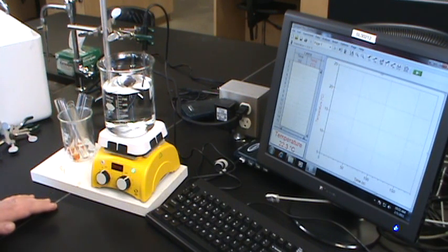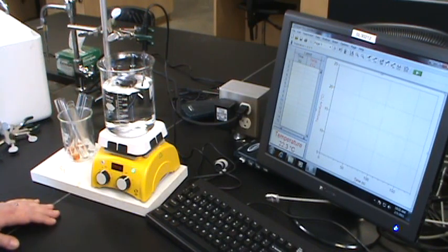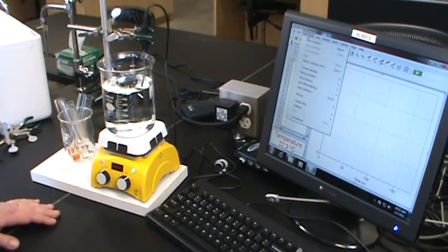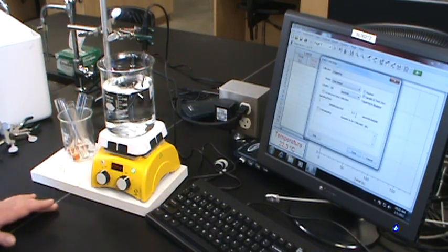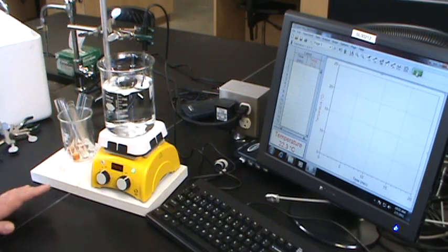Now, what else do we need to set up? This time is only for 150, 180 seconds. We want a really long time run. So let's go up in experiment setup, go to data collection. Let's go ahead and tell it to do 1 sample per second, and let's do that for 20 minutes. You can do it for even longer than that if you really like. There, we're done. So now we're set up for a 20-minute data collection. Now let's just go ahead and click start.